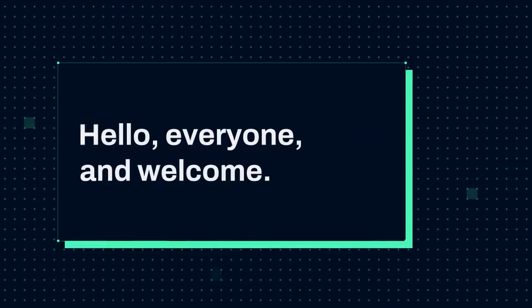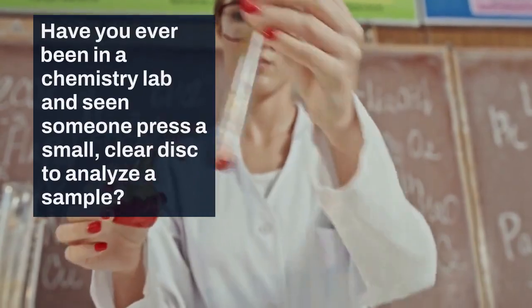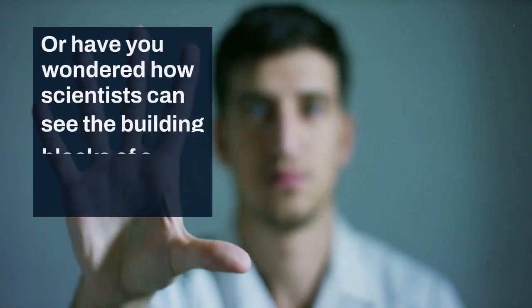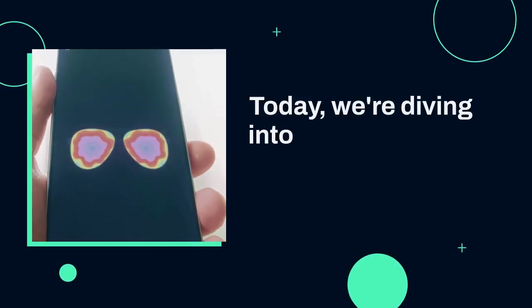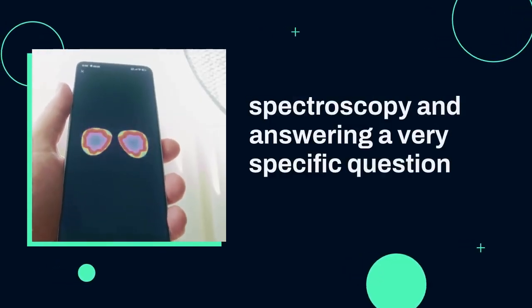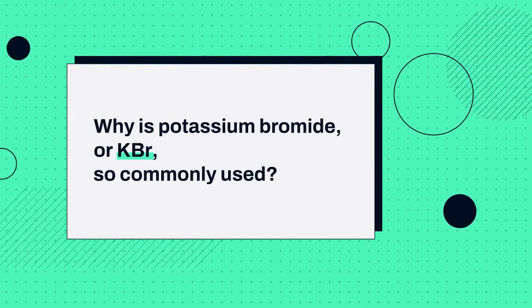Hello everyone, and welcome. Have you ever been in a chemistry lab and seen someone press a small, clear disc to analyze a sample? Or have you wondered how scientists can see the building blocks of a molecule using invisible light? Today, we're diving into a key technique called FTIR spectroscopy and answering a very specific question: why is potassium bromide, or KBr, so commonly used?